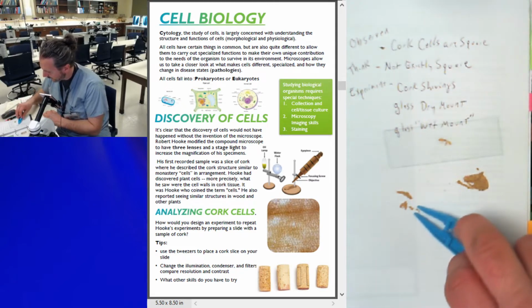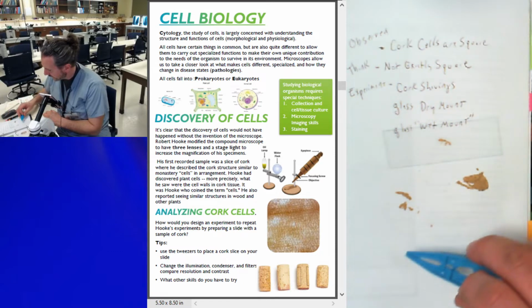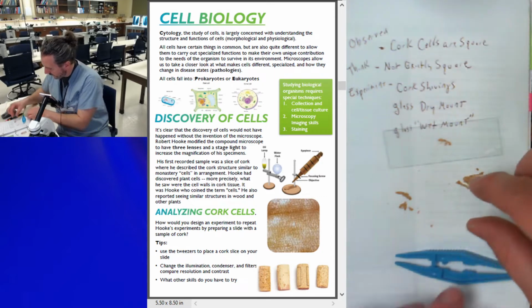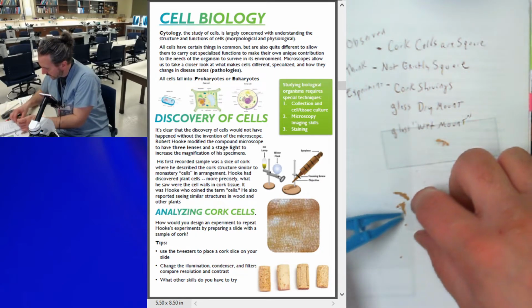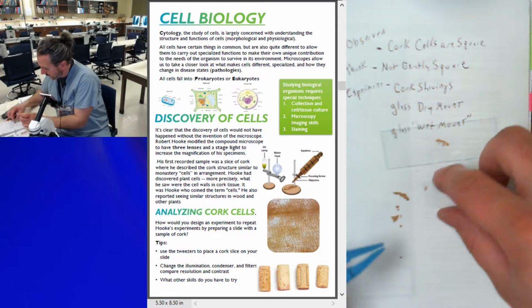Okay. Back to square one. Don't really want to crush them. Let's try something new. I will just push. It's like a dustpan. Push some of these shavings. I don't really want the thick shavings.